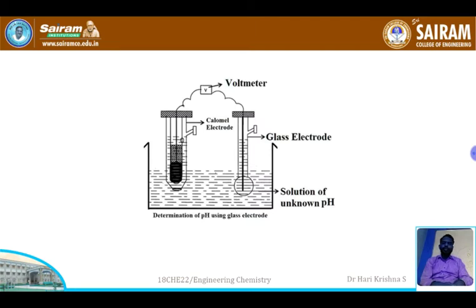You might have seen in your practicals how to determine the potential using a Wheatstone meter bridge. The sample, glass electrode and calomel electrode are connected to the voltmeter, and we take a jockey and move it on the bridge.